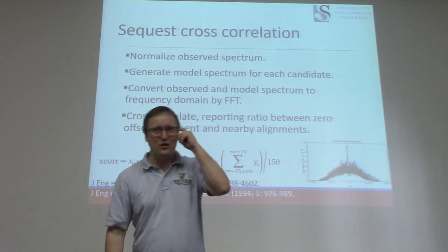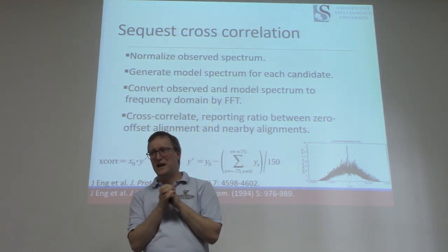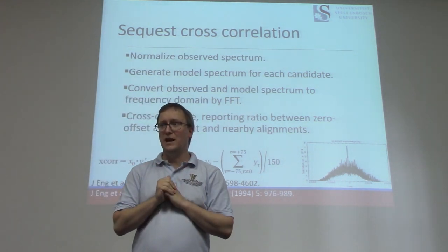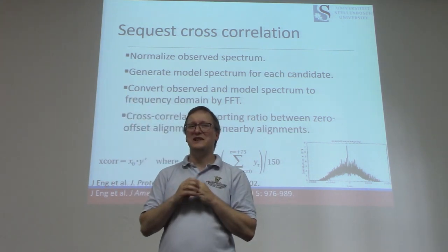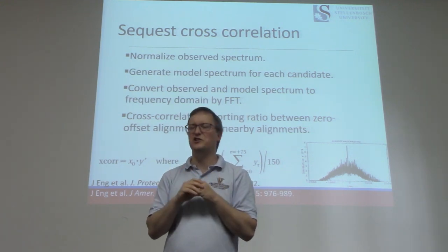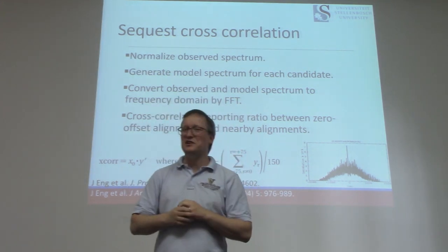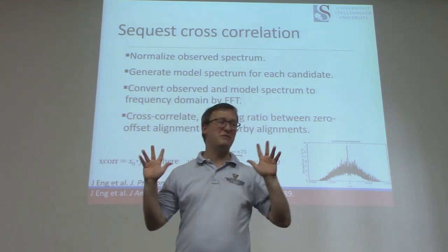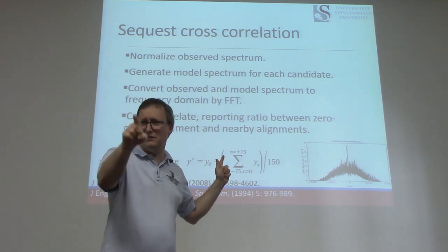All right. Now, I tried to limit myself on how many equations I show you, but I'm going to show you just one. So here we have an example of one of the very first scoring approaches. We have an electrical engineer in the room, and electrical engineers tend to make use of this technique called cross-correlation a fair bit, or mechanical engineers do anyway. They're the same thing, right? No, they're not. They're not the same thing. All right, so cross-correlation can be shown in an equation like this, but I'm going to try to show you with my hands. I hope you don't mind. If somebody wants to talk their way through the equation, they can do that. You don't want that one.